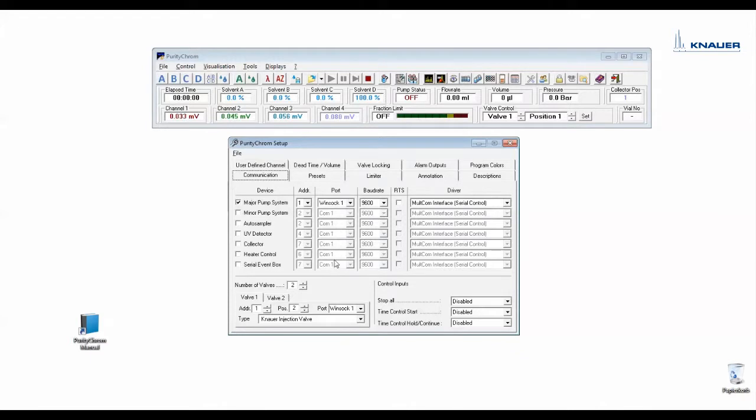Here you see the right port numbers according to the chosen LAN and COM ports which were entered in the Purity Chrome.ini file. On the right side you can choose the correct drivers for your devices.